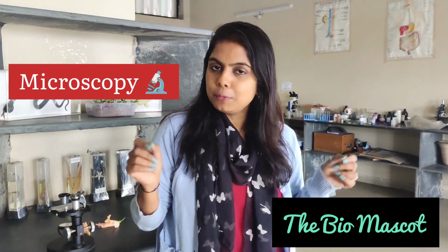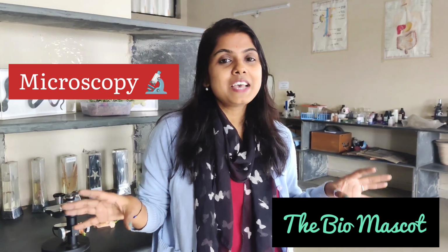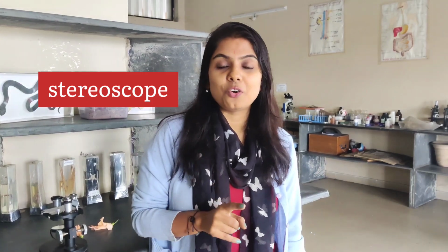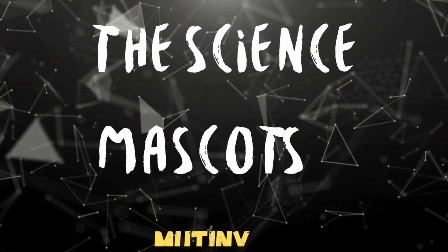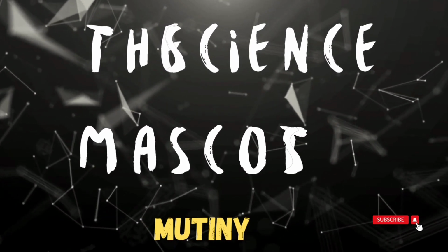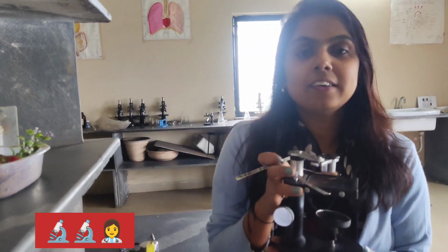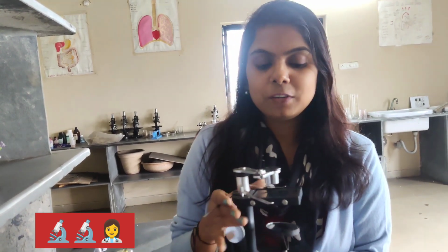In this video today we will be talking about a very common microscope which is present in every biological lab and I am talking about dissecting microscope, also called as stereo or stereoscope. Microscope which I am talking about. By the way, we are having multiple types of dissecting microscope, but this is a very common one which you can easily get in any store, even online as well. So let's talk about this microscope.